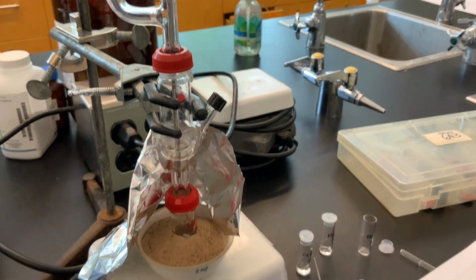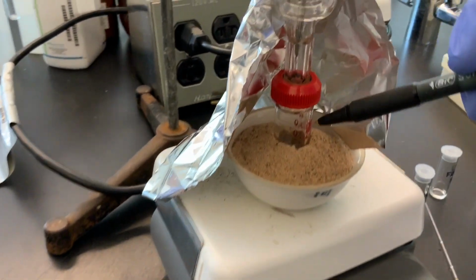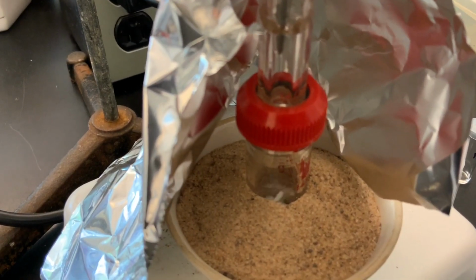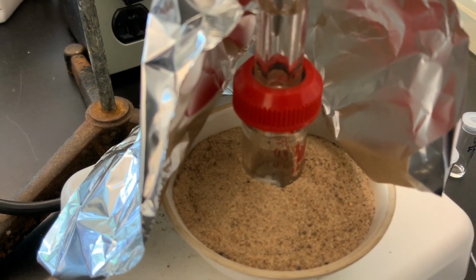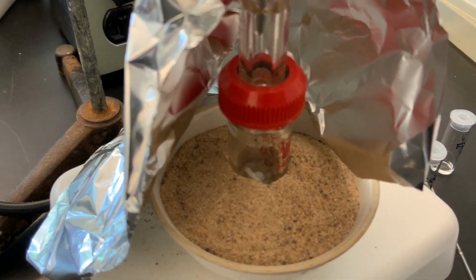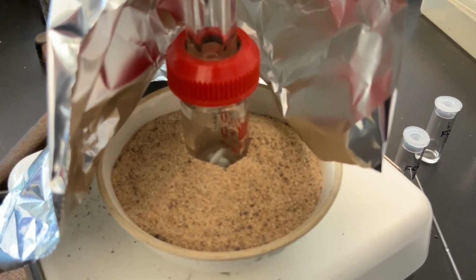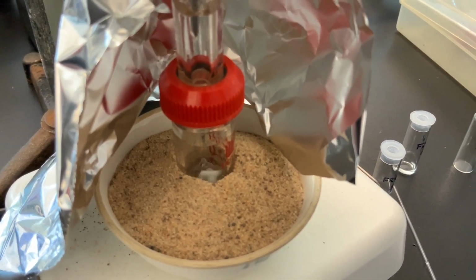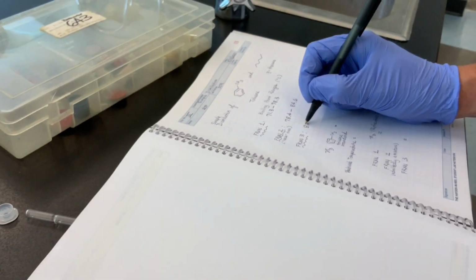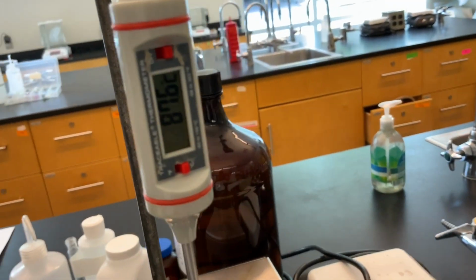Now what we're going to do is we're going to increase the heat to about 7 to 8. You can look down, of course, it's nice to always do that, and see that there's still liquid remaining, and so that's the remaining toluene, and so we'll stop once all of the toluene has distilled over. And so it's going to be 85.6, and we continue to note that the temperature is still rising here.